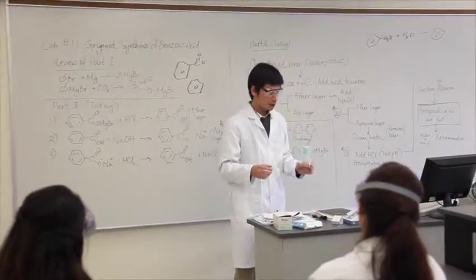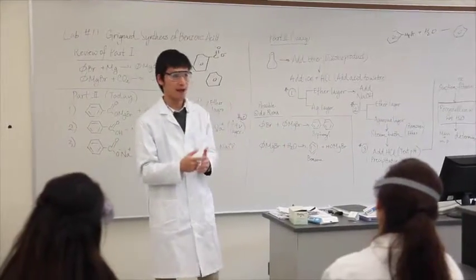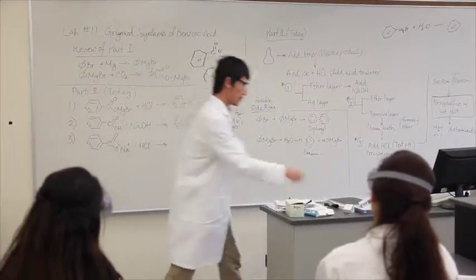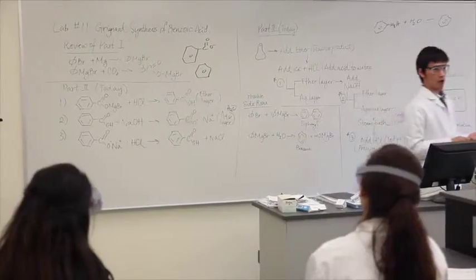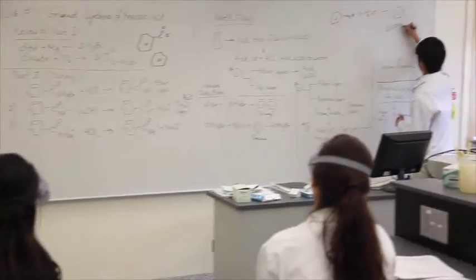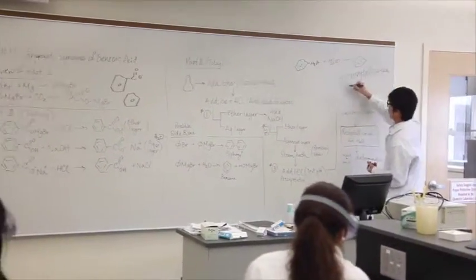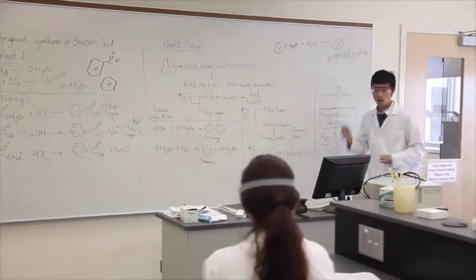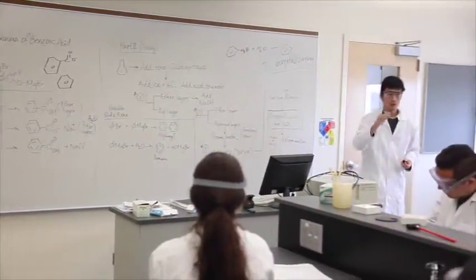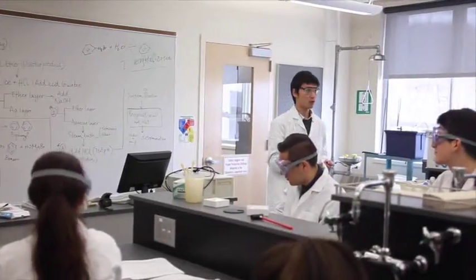That's the first step. So the first step of this lab, we're going to work on the reaction by acid and base extraction. And the second step, we're going to purify the compound even more with crystallization. I'm going to talk in more detail about the second step later, after you get the product from the acid and base extraction. Okay, do you have any questions?